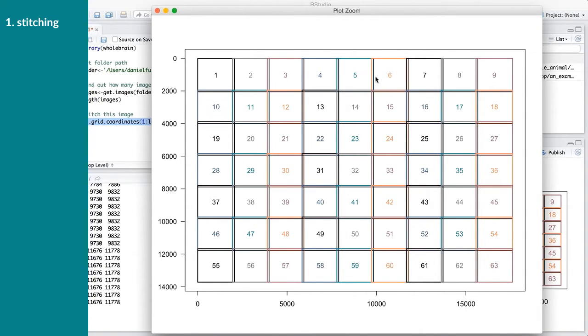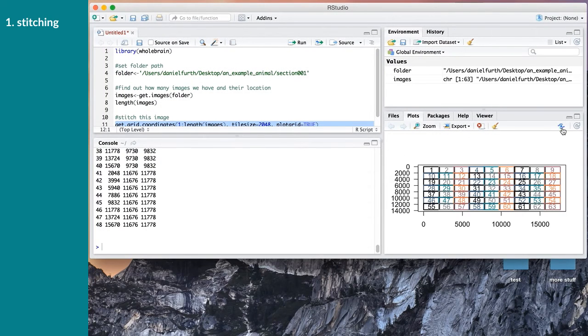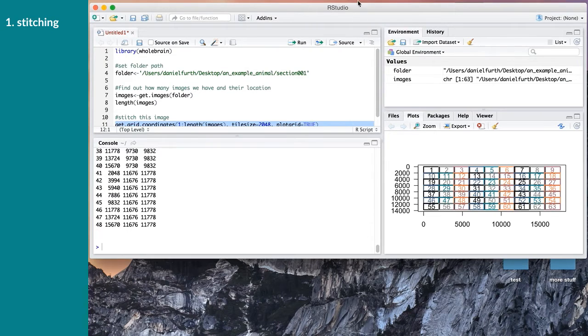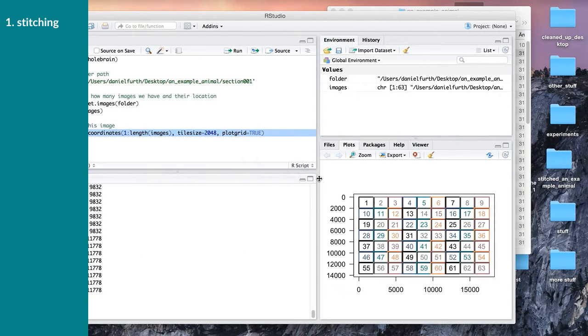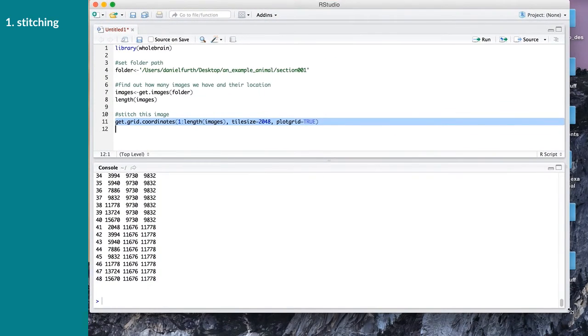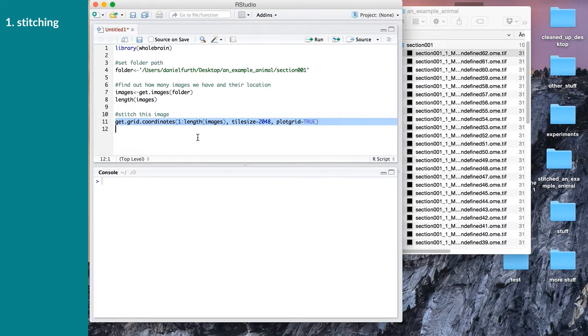So you have this kind of option, either row by row or snake by row, and either right and down or left and up, and you can set this with different arguments to stitch, either the order argument or the type argument, where for type, snake is the default, and for order, the default is left and up. But if you have other settings, those are available as well.